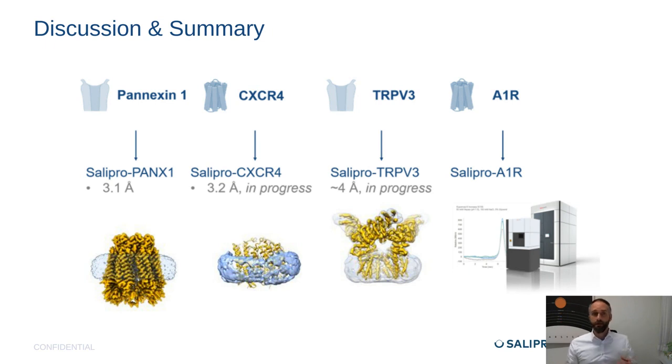Since we saw a tetramer, we wanted to investigate a bit further with some biochemistry as a follow-up to see what we're looking at.